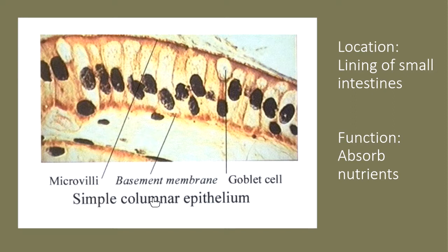When we look at this, I want you to notice that we do have some labels. This cell right here is a different cell from the rest of these. You can't really see its nucleus. Over here's another one, right? These cells have an opening to the top, and they're releasing this mucus that we see on the surface of this epithelium. These are our goblet cells that we talked about in lecture. These are the unicellular glands that make mucus, and here we can even see that mucus.